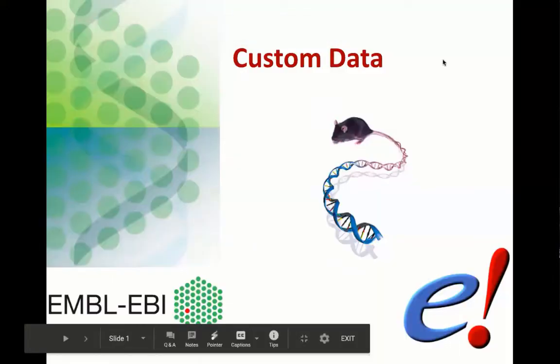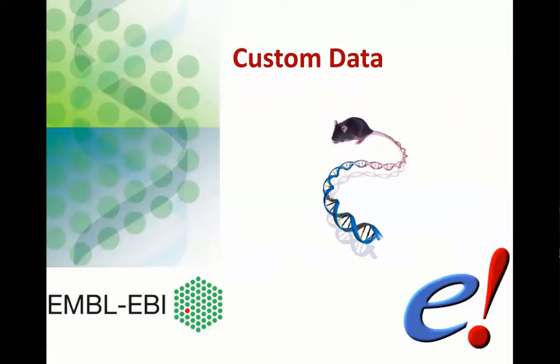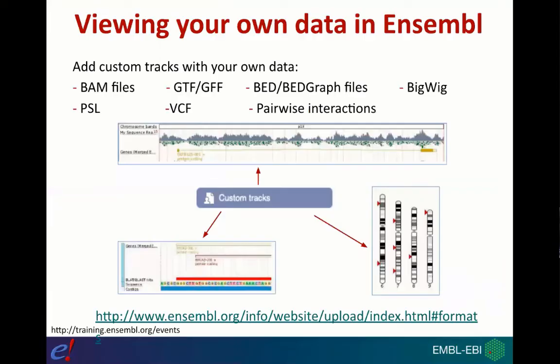So it's important to remember in this module that what we are not doing is submitting data to Ensembl as a way that it then gets integrated in the Ensembl database and everyone around the world can see it and view it. This is a way of visualizing our own data sets alongside the publicly available Ensembl data. So if you want to view your own data in Ensembl, you can do this.